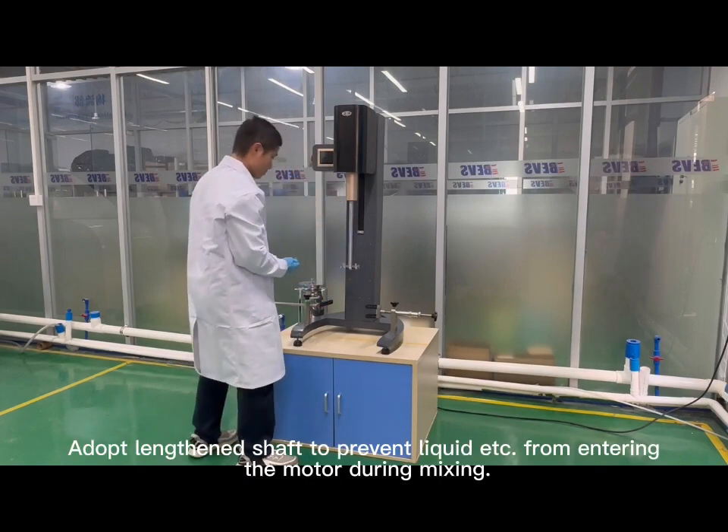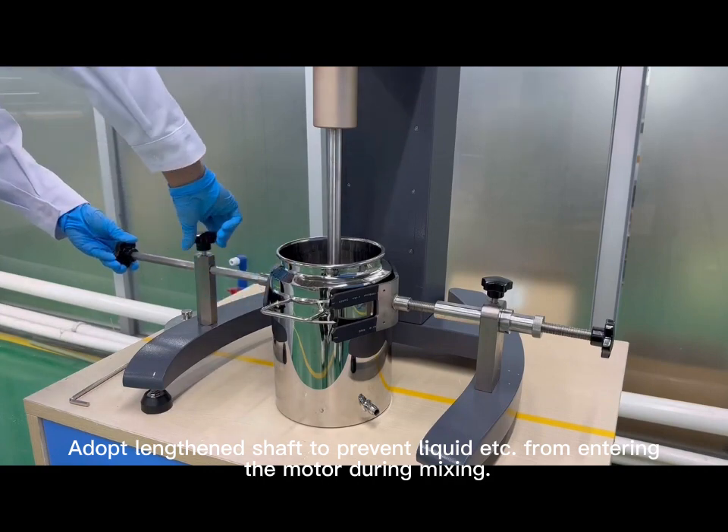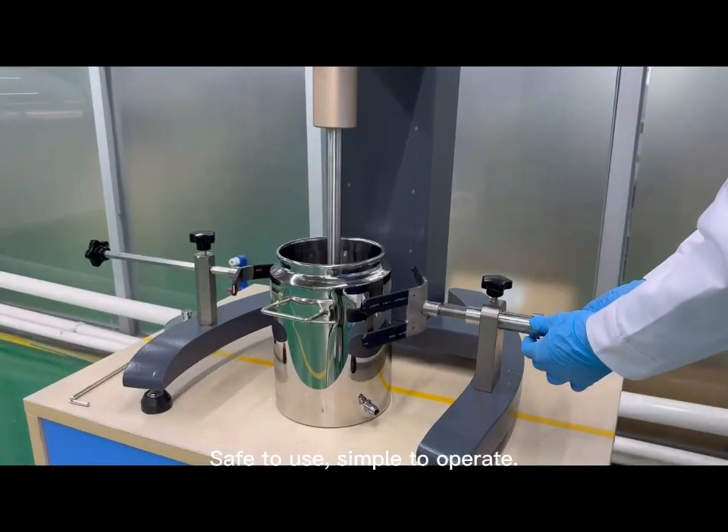Adopts a lengthened shaft to prevent liquid from entering the motor during mixing. Safe to use, simple to operate.